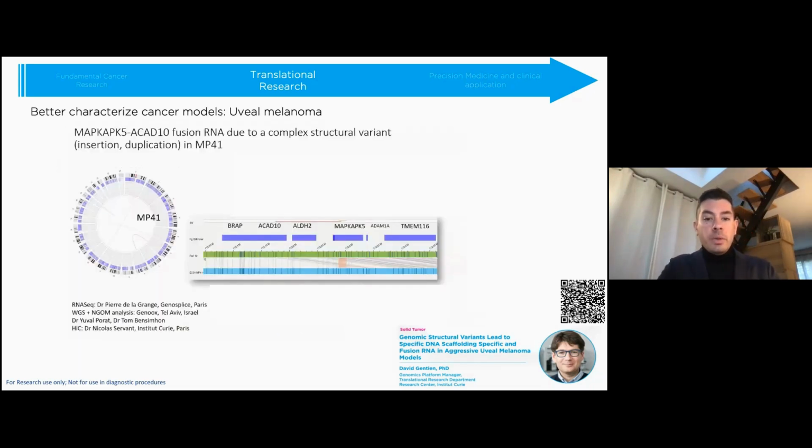The RNA sequencing approach is pretty heavy. It identified over 300 fusions using a combination of 5 algorithms and extensive data curation, and only those called by at least 2 algorithms and in 2 independent replicates were considered solid. 14 were kept for validation, all of them found by optical genome mapping, without the need of a complex bioinformatic pipeline here.